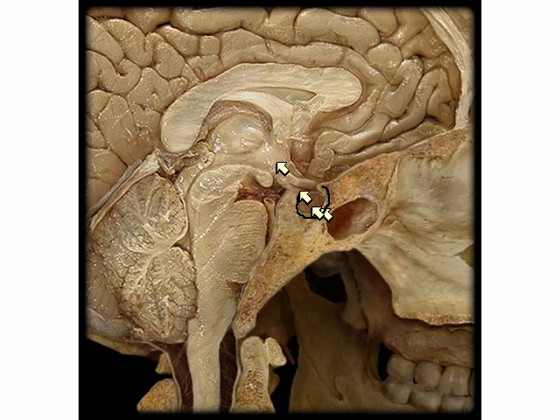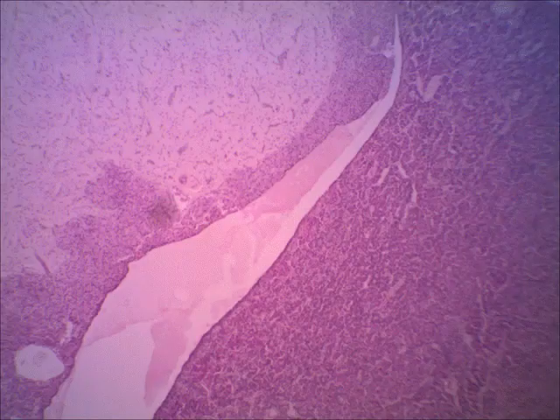On these next slides, we're going to be looking at the pituitary gland through the microscope. It may take just a moment. When it does, you'll notice two distinct regions that in this slide are separated by a space. Do not worry about the space. Sometimes on the slide preparation, the two areas of the pituitary gland do get separated. But on this slide, on the right side, you can see a darker, more grainy looking tissue. That's the anterior lobe of the pituitary.